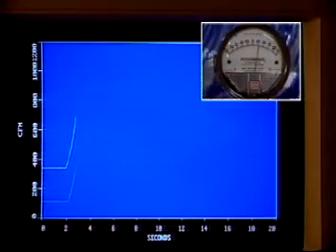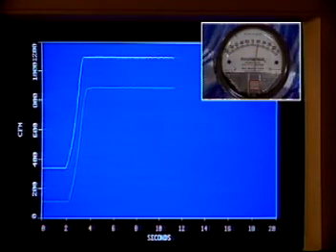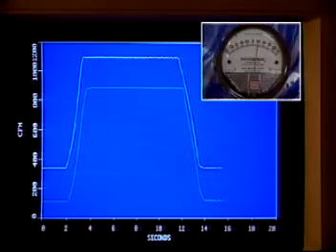Here is a graphical representation of airflow volumes versus time for this sash opening and closing. The top line is the total exhaust and the bottom line is the total supply into the room with 2 seconds per horizontal tick mark.